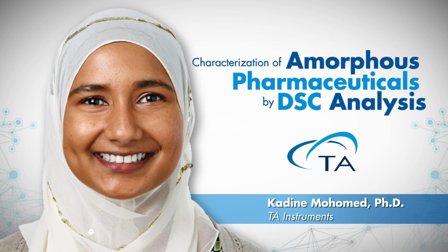So the glass transition falls into the heat capacity function of the equation, which is termed the reversing heat flow signal. Kinetic events like crystallization will always go into the non-reversing heat flow component or kinetic component of the equation. Melting, which is a latent heat, will fall into either the reversing heat flow or non-reversing heat flow signals. It's not a heat capacity change within the material, so it's not always completely deconvoluted from the glass transition.